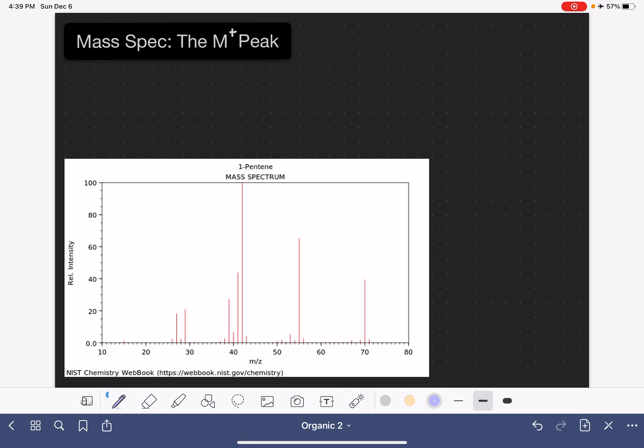So first of all, how to find the M plus peak. The definition is one of the things that makes it confusing. The M plus peak is always the most abundant peak on the right hand side of the spectrum. This definition, I think, is what contributes to a lot of students' confusion.